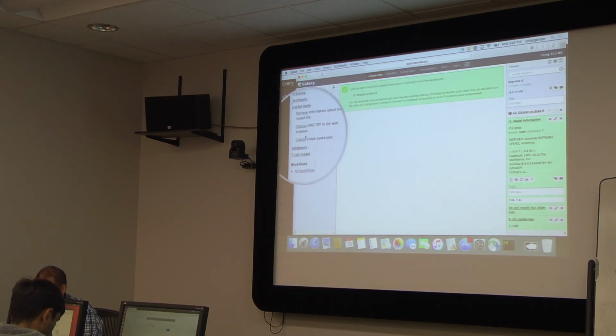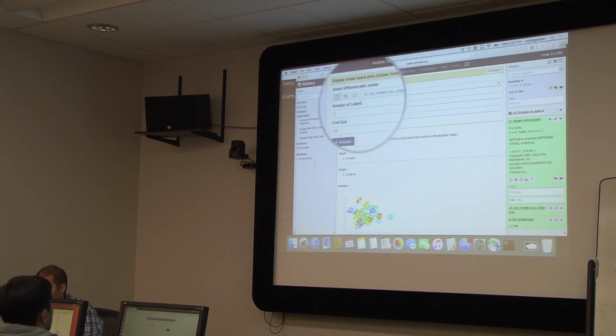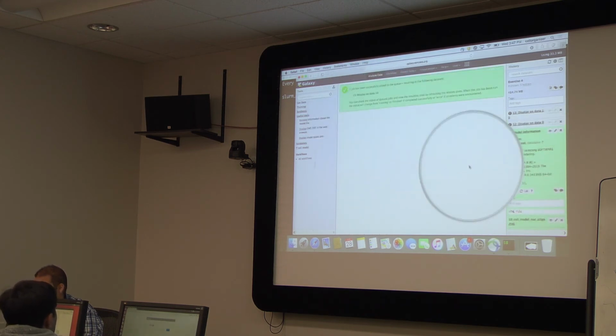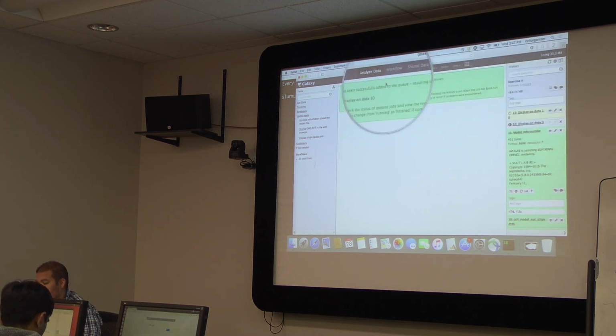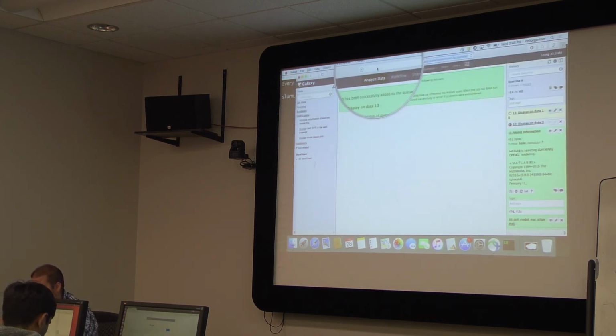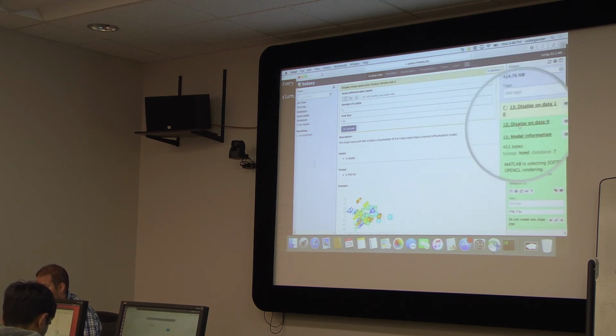So we're going to click on Display Shape Space Plot. We're going to select the cell and nuclear alignment, and let's see what it looks like. Now, doing this kind of embedding of the shape space into a 2D plot helps you visualize how shapes look a little bit different.